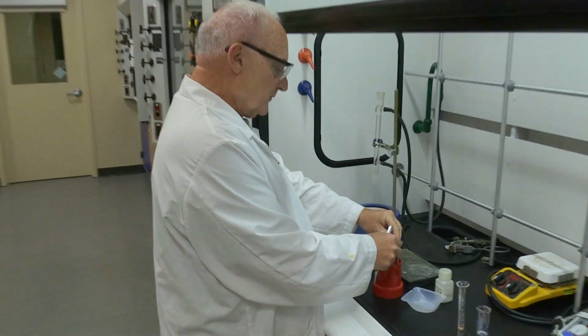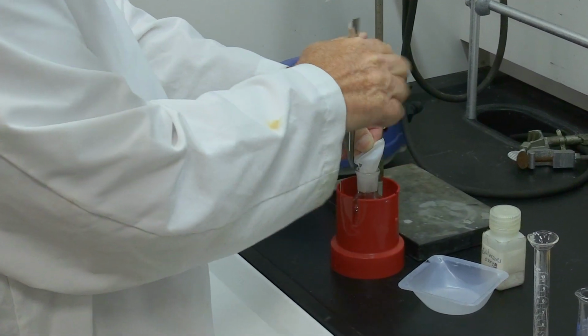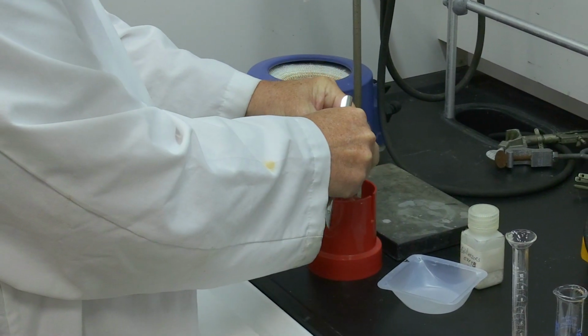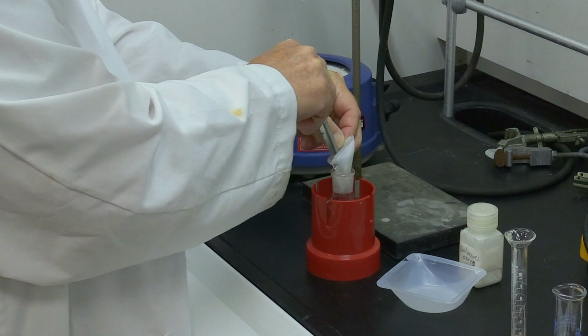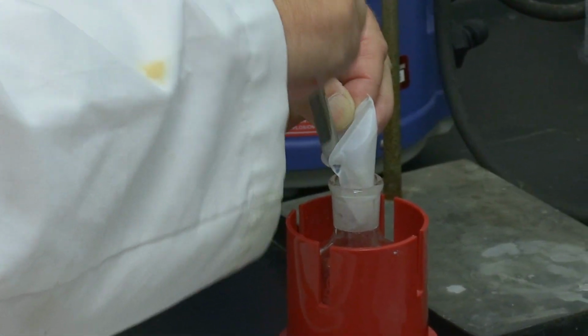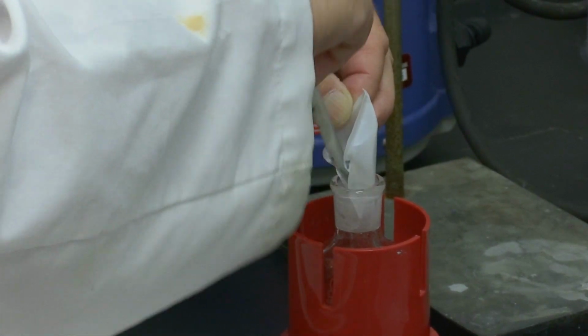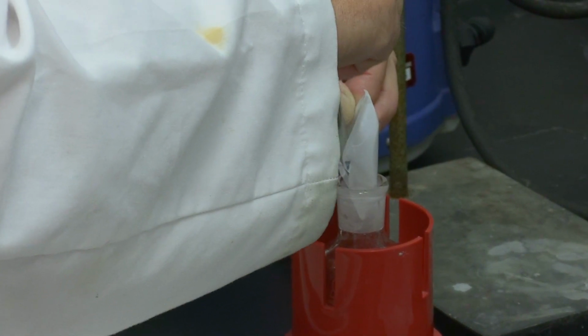So we added the fluorene, and now we're in the process of adding the potassium hydroxide, which has been sitting in the weighing container for a few minutes. And what happens typically with potassium hydroxide, it picks up a little bit of moisture, so we have to kind of force it in.